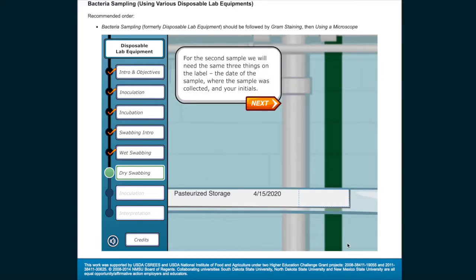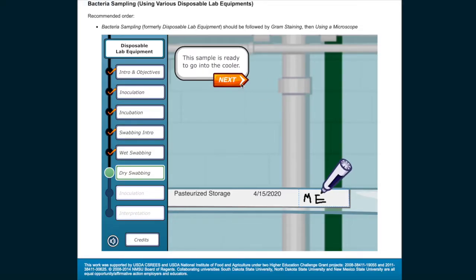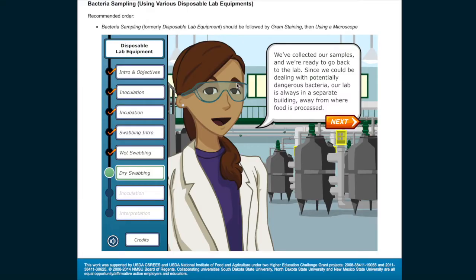For the second sample, we will need the same three things on the label: the date of the sample, where the sample was collected, and your initials. Go ahead and write your initials in the blank area provided for labeling. This sample is ready to go into the cooler. We've collected our samples and we're ready to go back to the lab.